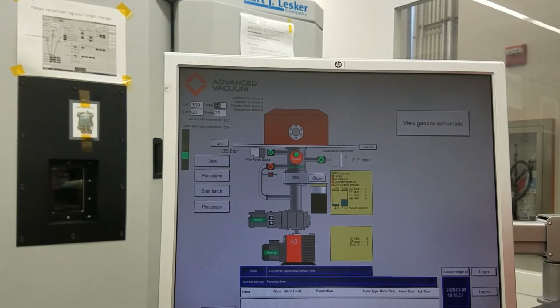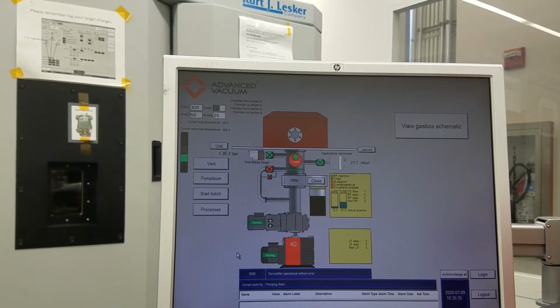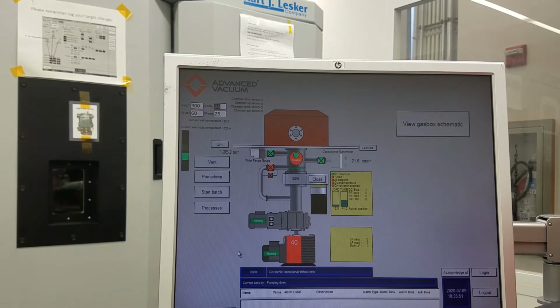The reason we need to open the chamber is that when you come into the clean room first to use PECVD, the first thing you should do is open the chamber, because sometimes some people run really long depositions but forget to run the etch-back process. I will talk about etch-back again later. Because of that, there's a lot of deposition on the chamber wall, right?